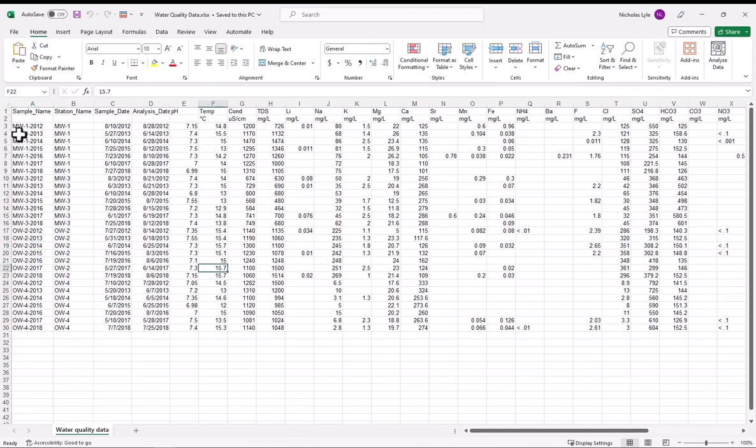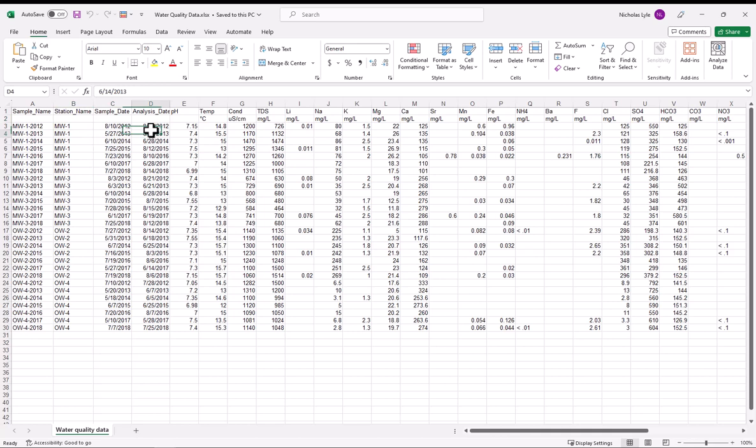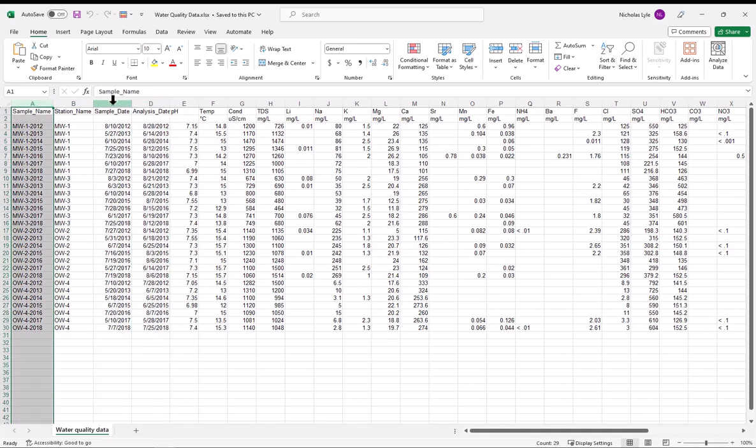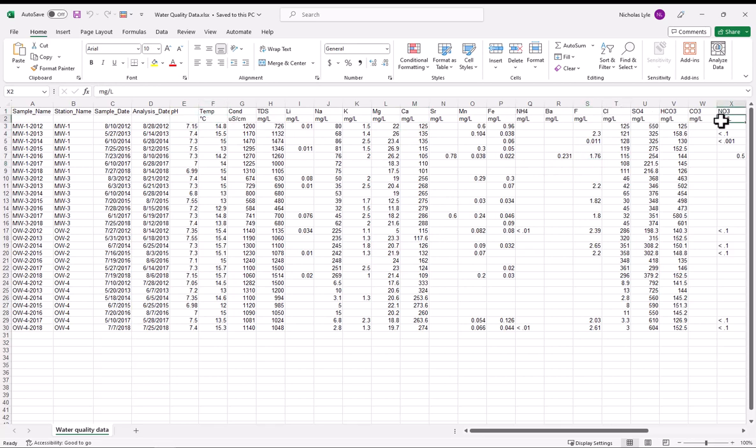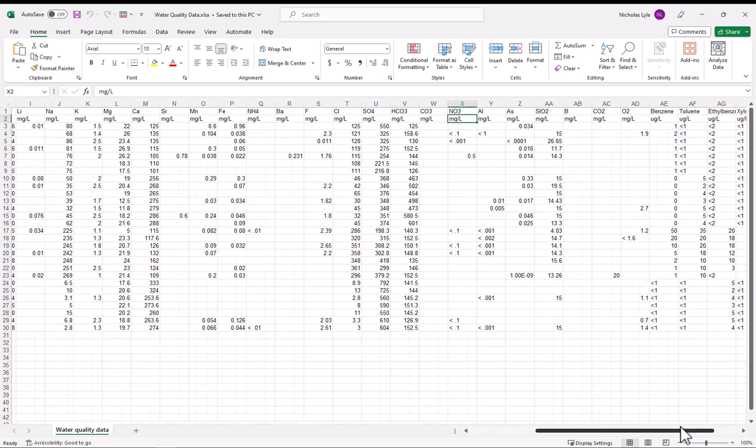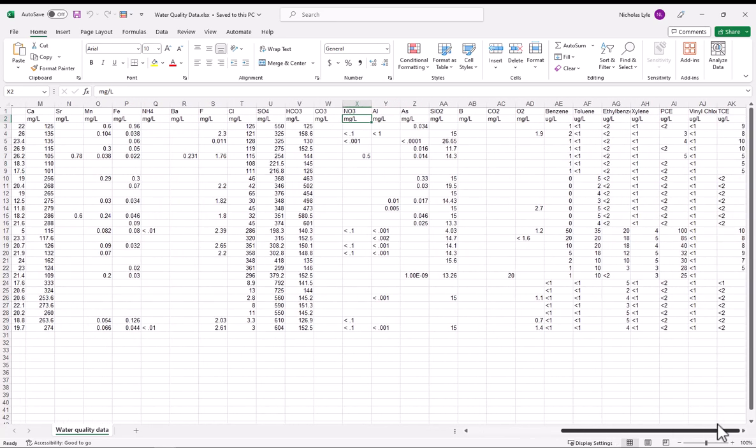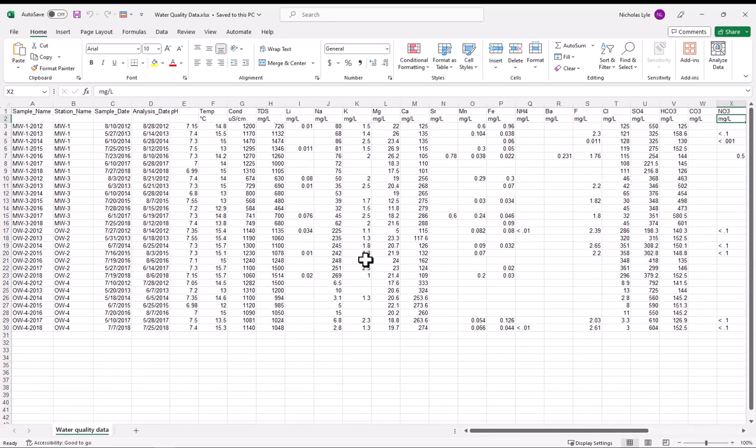So here we've got a sample name, the station that it's associated with, which as you recall, I mentioned was mandatory. Sample date, analysis date, so this is all sample metadata. And after the metadata, we've got the actual results for each individual parameter. So we've got the results for the pH and the calcium and so on. There's also this units row, which is quite important. But this is only one way that you can import data.